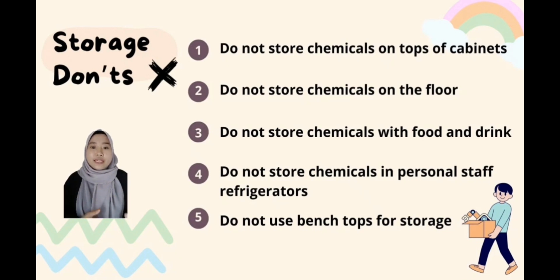When storing flammables in a refrigerator, use an approved explosion-proof or flammable storage refrigerator only. Do not use the benchtop for storage. This workspace should contain only chemicals currently in use for your experiments. Following these simple guidelines will get you well on the way to an efficient, organized, and safely operating laboratory. Spend a few minutes going through the lab with this list on a regular basis, and you should avoid any major incident with chemical storage. As always, safety first.